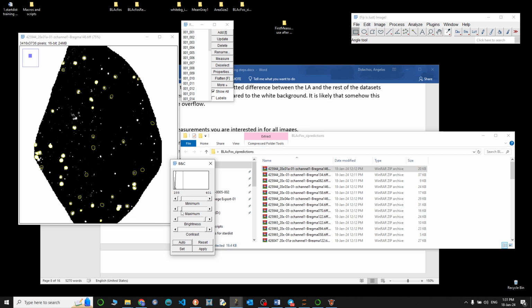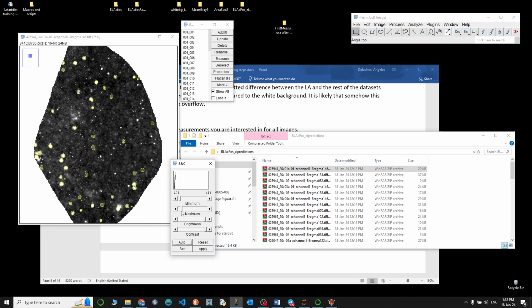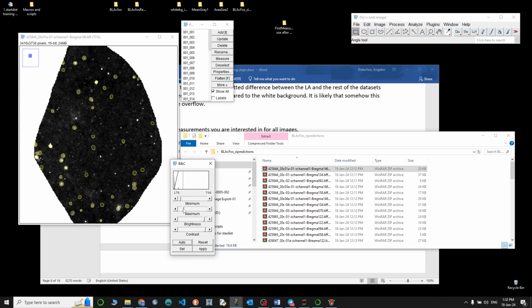But of course the point is not to tweak the brightness that much, to maintain a prediction point. I would advise to keep the mean gray value and only make small modifications in the display value, like here, to see first of all how well your predictions work. But we will probably talk more about this at a later point.